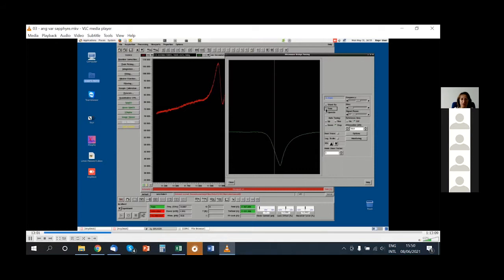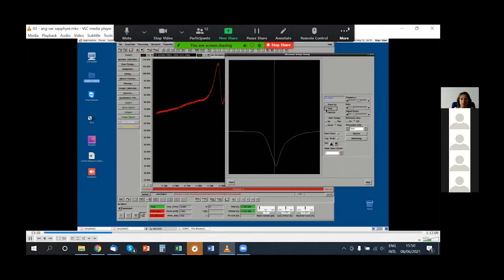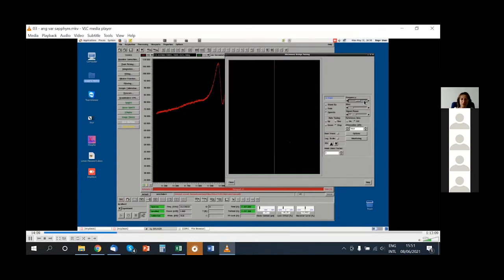And to rotate, we have to go back to the tuning mode. We rotate the sample, we tune again, and after that, we measure the spectrum. And we are doing the same for every sample rotation. This is why this experiment is quite long. But we will do it very quickly.